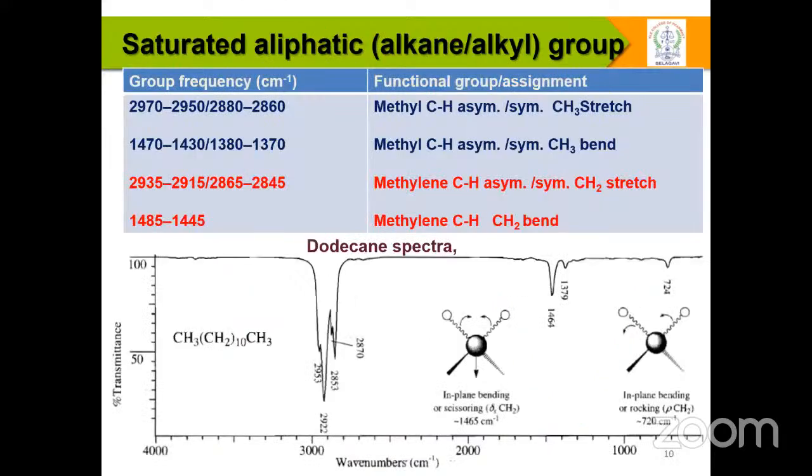Let us start to understand the simple alkane. If you take the alkane, there are two important things: symmetric and asymmetric CH stretching of CH3 and CH stretching of CH2, and along with that the CH bending of the CH2.